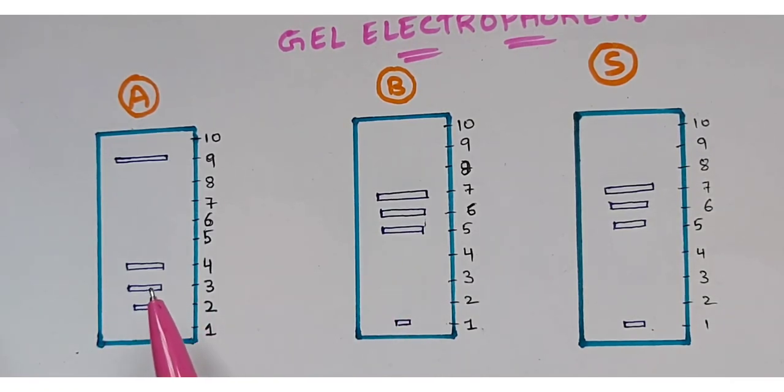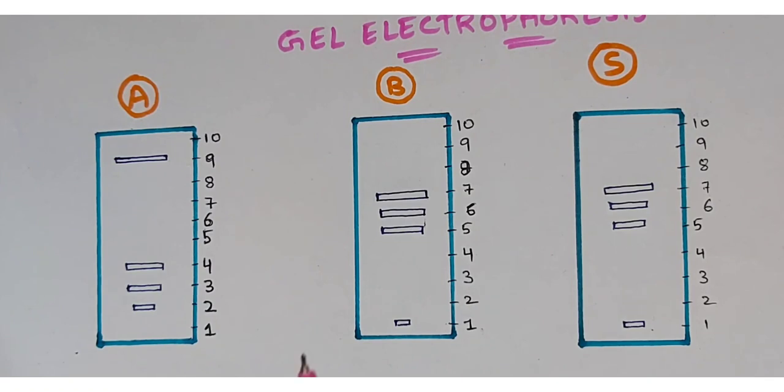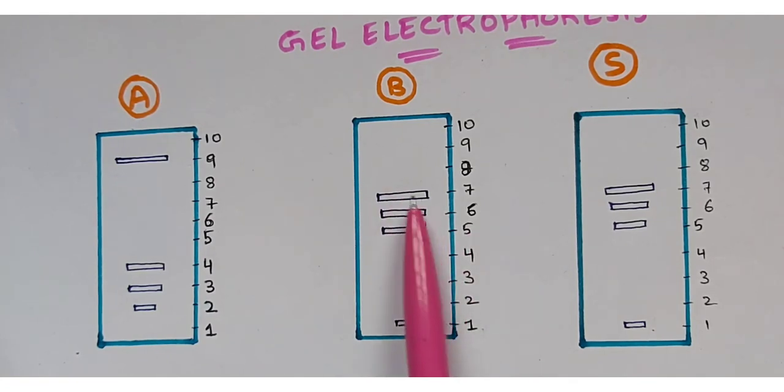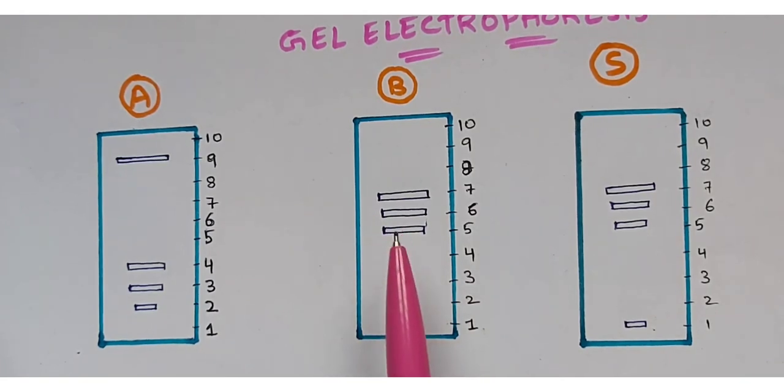So now what you're going to do is place the radio labeled probes in such a way as to identify the genetic information. And then you are going to take a nitrocellulose paper. So what is this nitrocellulose paper? You are going to place this agarose gel plate upon that nitrocellulose paper in an inverted manner. Then what will happen? Then all of these strands will get attached. I mean, all of these DNA strands will get attached upon the nitrocellulose paper.